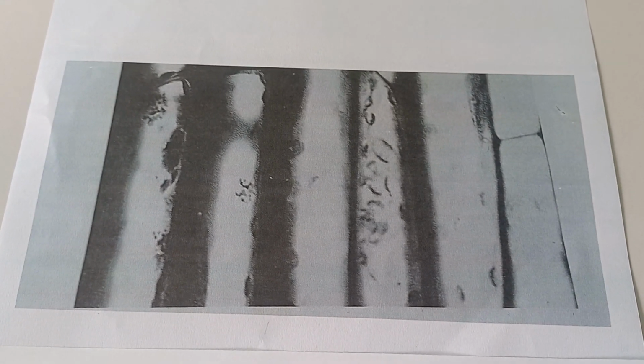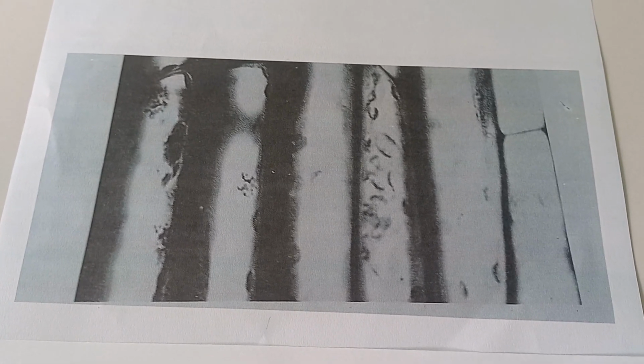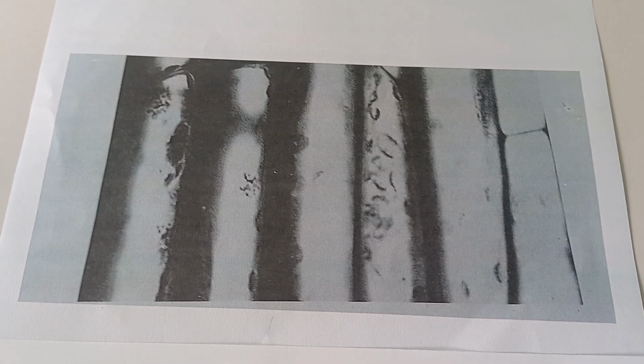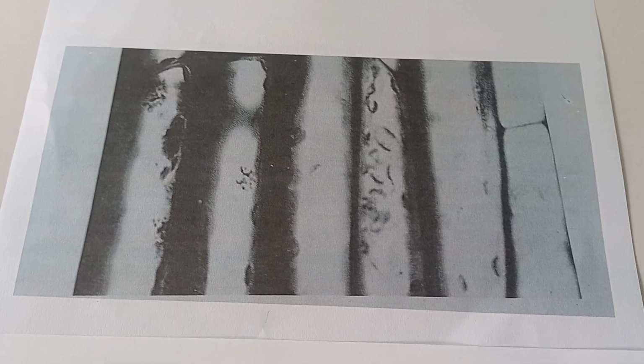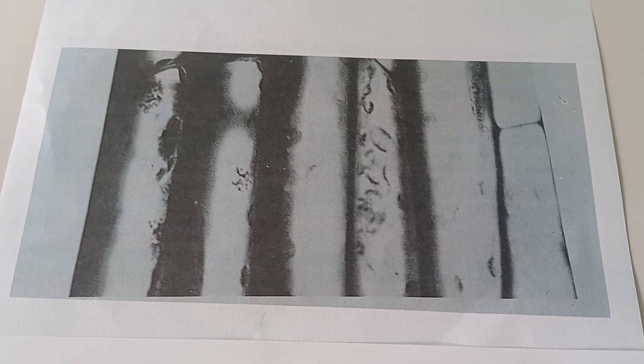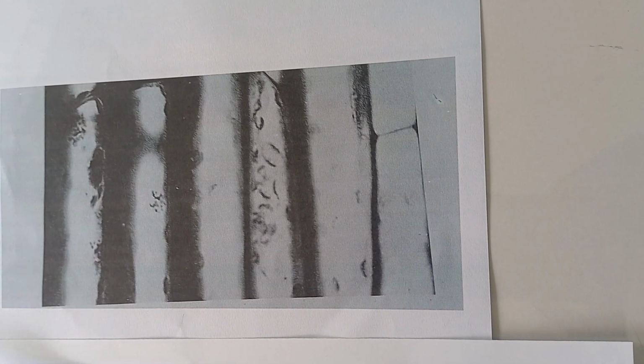In today's lesson, we are going to discuss techniques to draw Collenchyma and Sclerenchyma cells from plant sections under a high-power optical compound microscope. This is a follow-up on techniques to draw plant tissues 1. Please check my previous lesson on plant tissues 1 because it shows the basis of the techniques. Thank you. Collenchyma cells are living cells, slightly elongated, and have their cell walls irregularly thickened with cellulose.